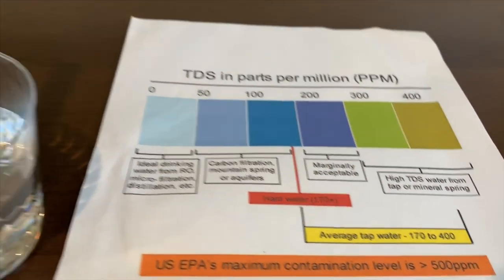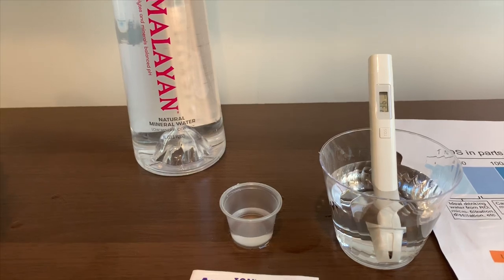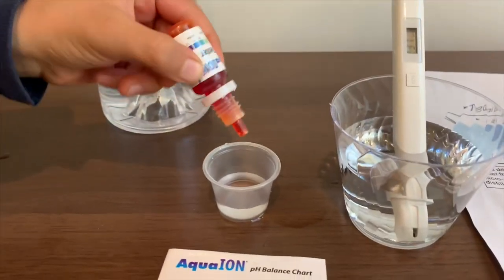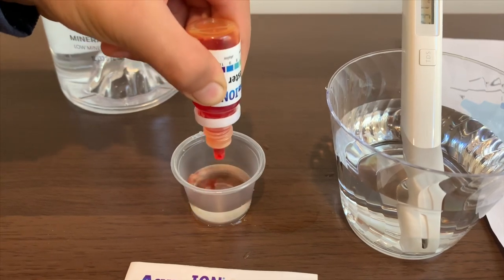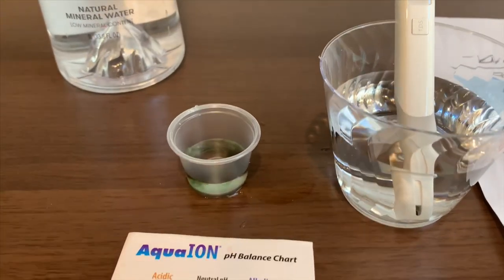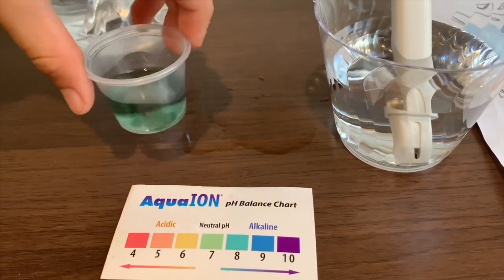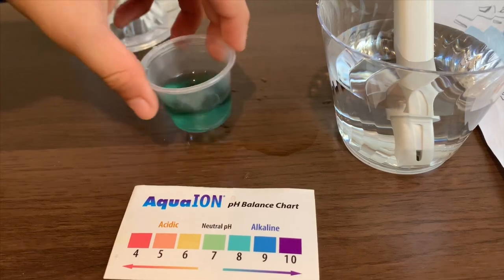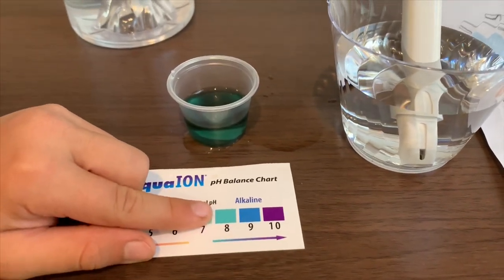Now let's test the pH level. Open the cap carefully and only do two drops. One and two. I give this an eight — that means it is alkaline water.